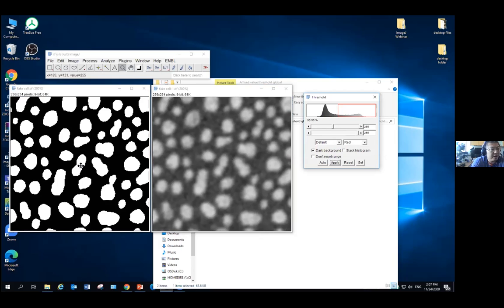So this one becomes the thresholded image, which we also call the mask image, or binary image, because this image only has two kinds of pixels. They're either black pixels with intensity 0, or white pixels with intensity 255. If you can get a very nice mask image that represents your object, your region of interest, then getting the selection of your object will be very easy, as we described in the previous webinars.